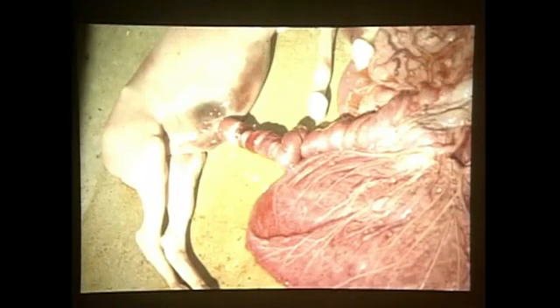Here is a set of twin placental membranes that shows maybe a reason why intrauterine death and abortion occurred, and that reason is that at least the chorion on this side is involved in a larger area of avillousness, and that may be just enough of villus atrophy to interfere with the maintenance of pregnancy.